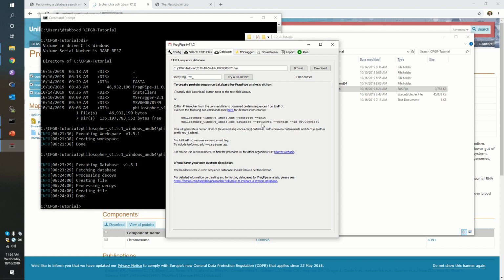Doesn't that mean that somebody else looked at it? It does. It does, yes. Uniprot, and particularly Swissprot, is distinctive in that it has a large group of human curators that examine sequences and confirm whether they're legit or not. In effect, what this means is that every protein in the Uniprot knowledge base comes from either the reviewed side of the shop or the automated side of the shop.